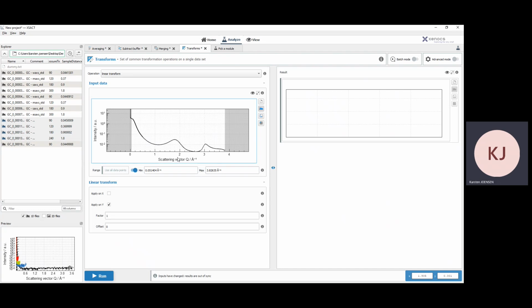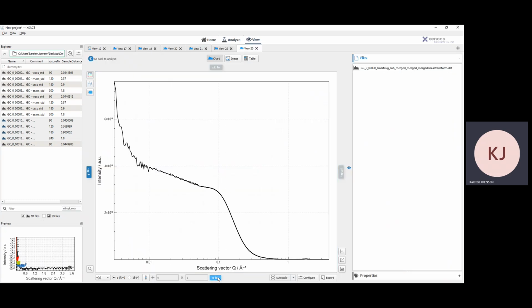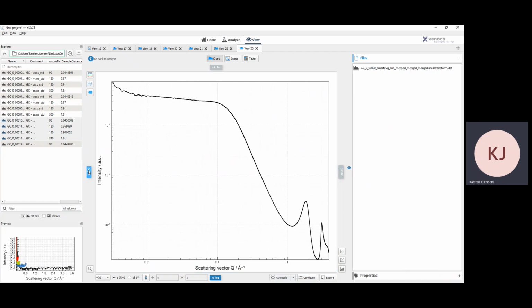Just want to make a note that if I'm in this window here, it looks like I've got fewer choices, but I can double click on that and make that a logarithmic curve. Close that, and then I'm into here, and I can still use those selection tools. So here, I'm good. I'm going to take that. I could also multiply or add some background or an offset to it, but this is the curve that I'll want. And then I'm in my final curve, which looks like this, and in logarithmic like this. And that's it for my curve.